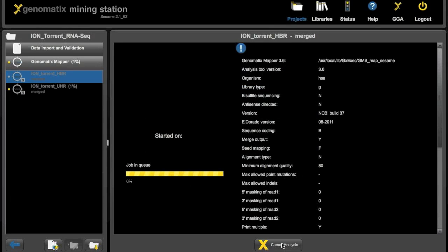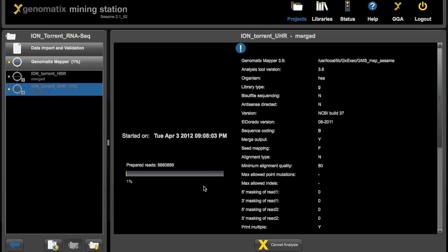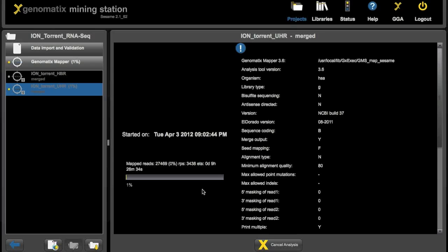So now let's go back and check what our first analysis is doing. As you can see this is at one percent. And in real time this analysis would take about an hour. And as you probably don't want to sit here watching the progress bar wandering to the right for an hour, we will just speed things up.